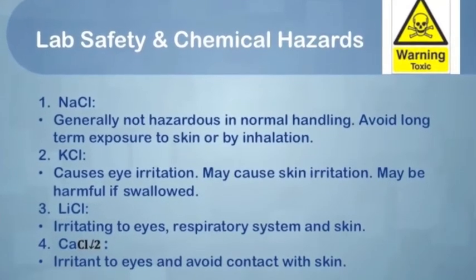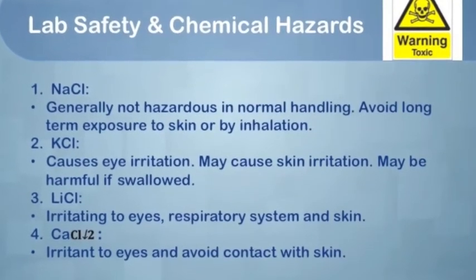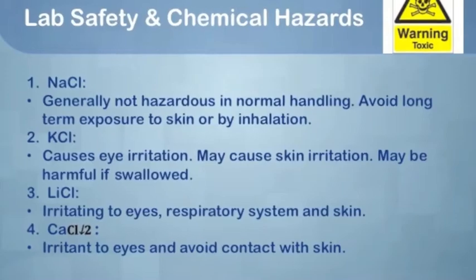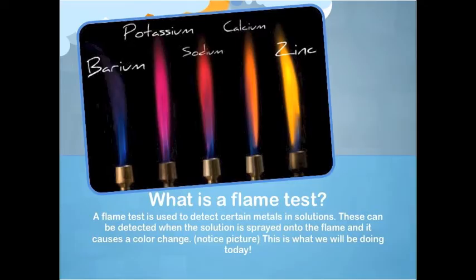Most of the chemicals you will be dealing with in the lab are detrimental to skin and respiratory systems. Just remember to spray the liquid directly into the flame. What is a flame test? A flame test is used to detect certain metals in aqueous solutions. When carrying out this lab, you will be determining multiple unknowns using this process.